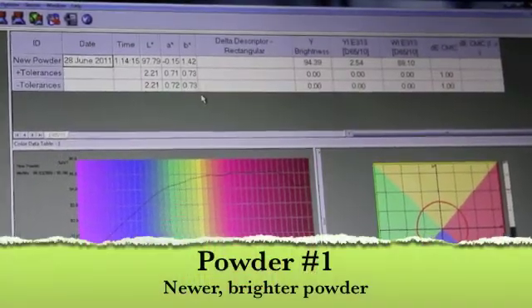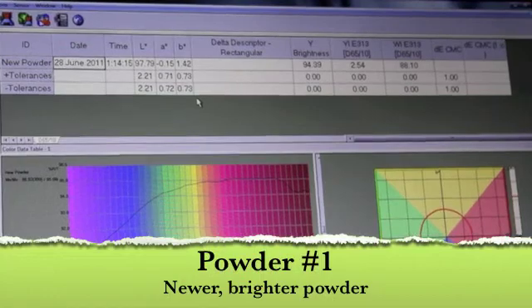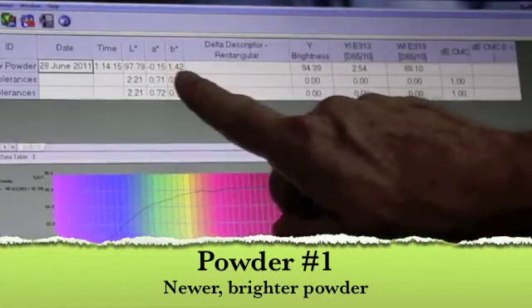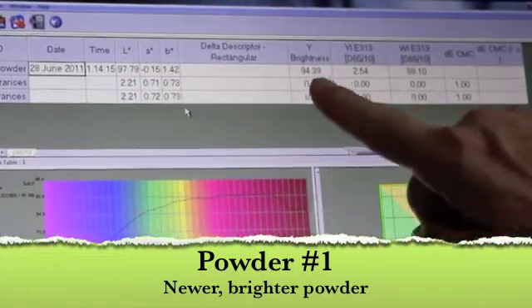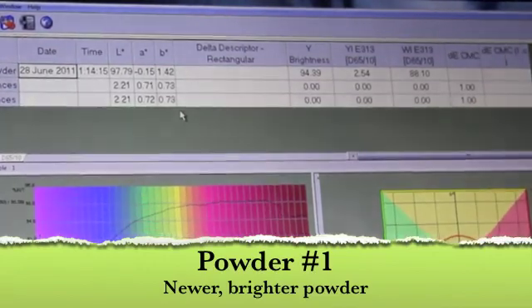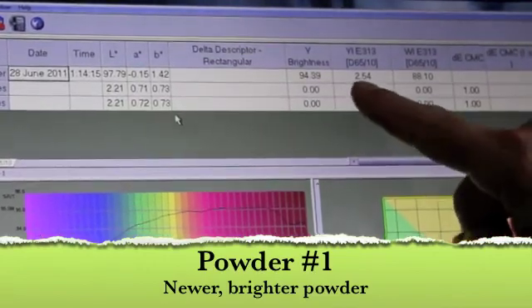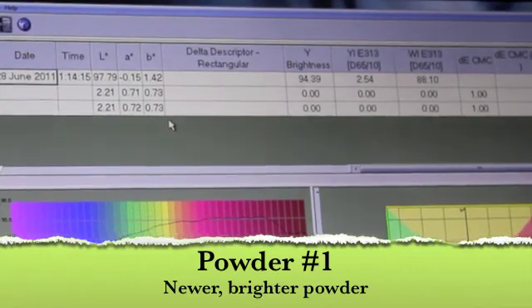And with our first reading, we have a nice bright product with very little color. The A and B value is close to zero. A nice bright product with a value of 94. A yellowness index of just 2, and a whiteness index of 88.